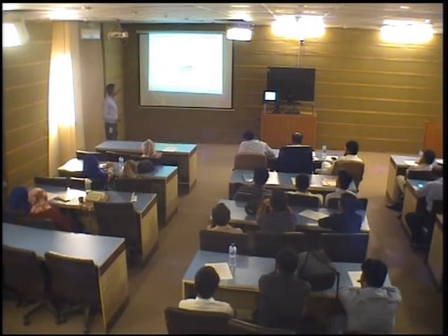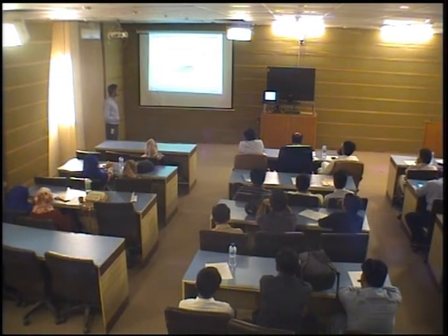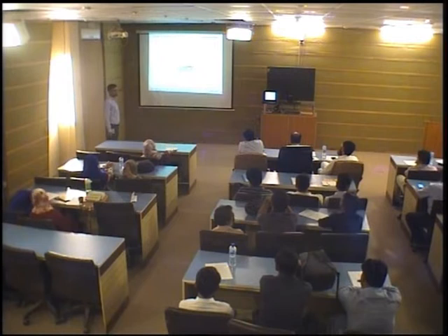Axial variation of intensities of a transition line. So this is basically a 3D spectrum, a 3D graph of the corresponding wavelength, and this shows the intensity of each emission line continuously decreases as the delay time increases, as the distance increases.